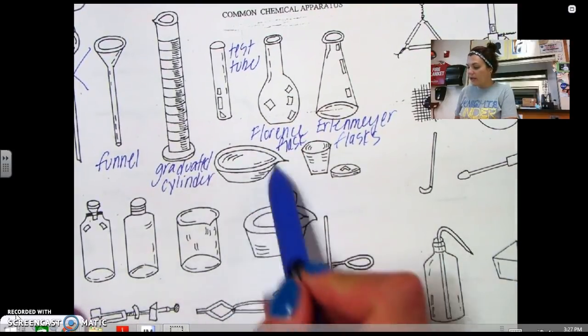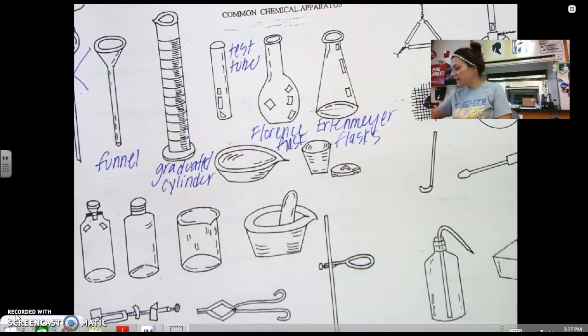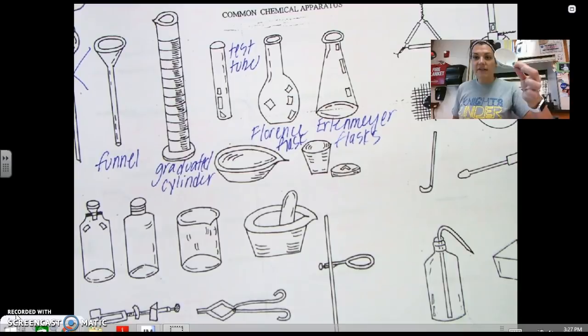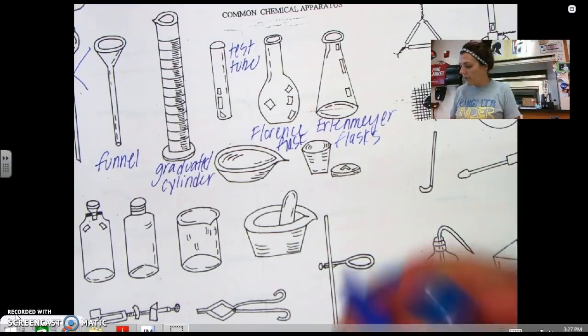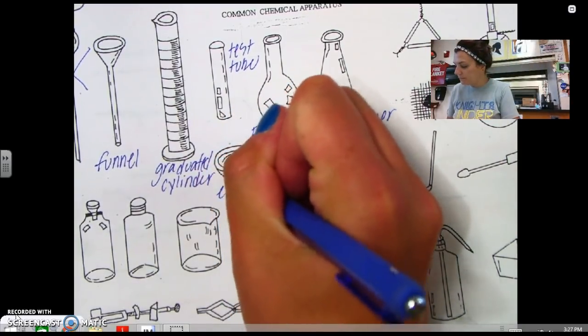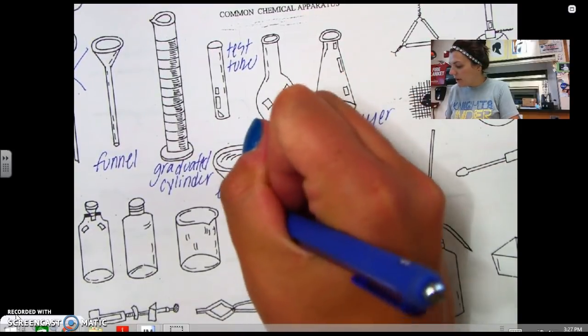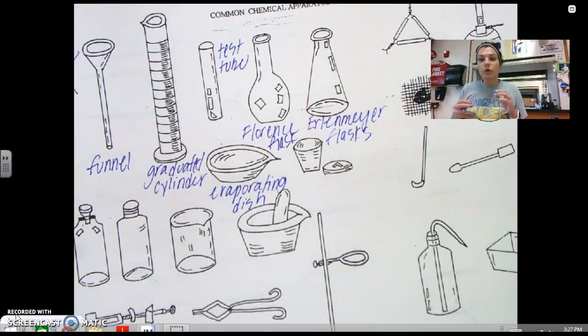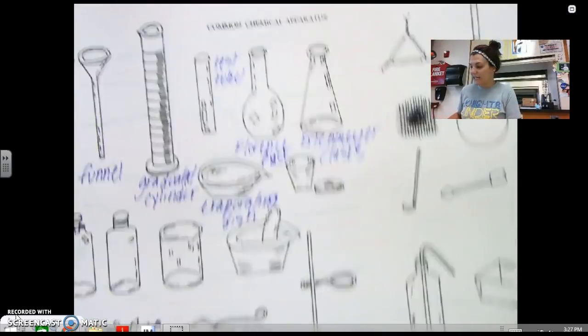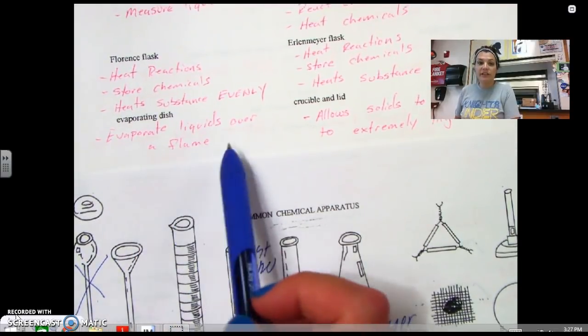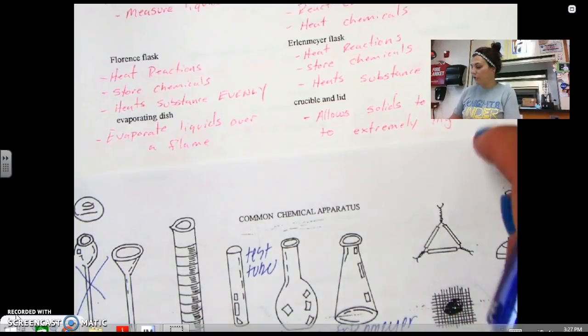The next guy that we have right here, this is called an evaporating dish. And you can kind of tell that it's kind of made out of ceramic. It's called an evaporating dish. And what we use an evaporating dish for is if we're needing to heat something to higher temperatures than what glass can handle. So an evaporating dish allows us to evaporate liquids over a flame.